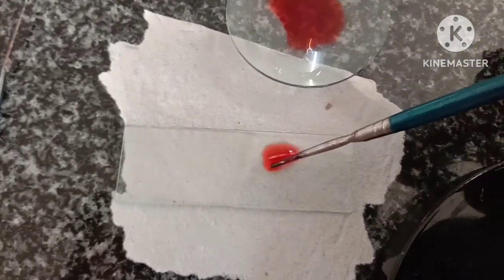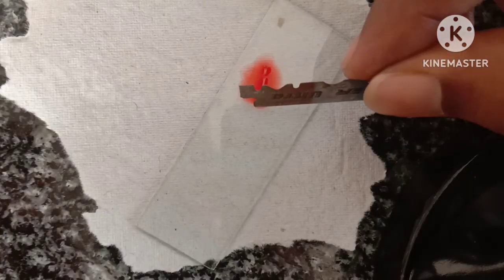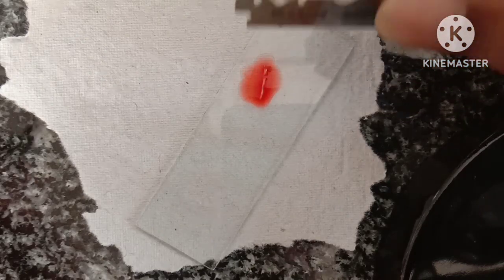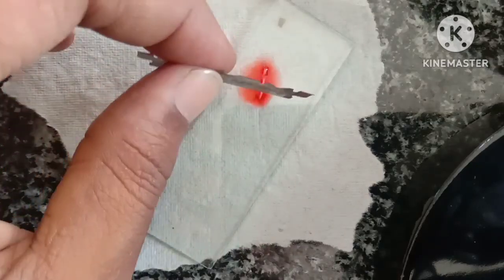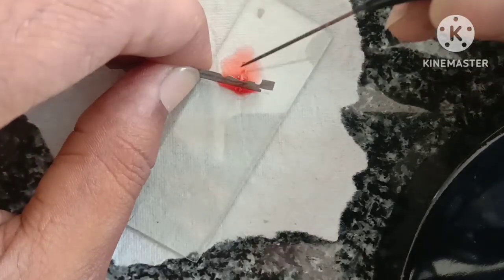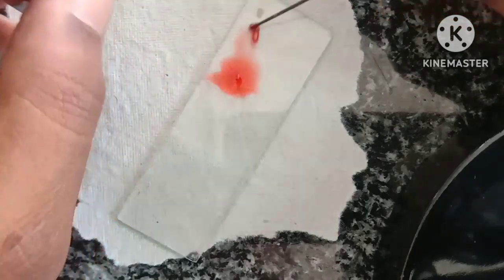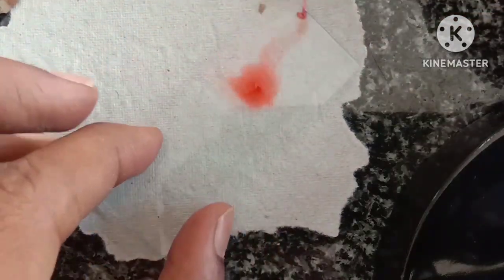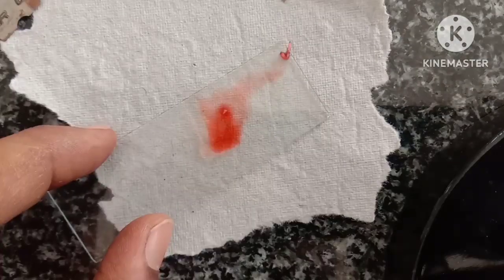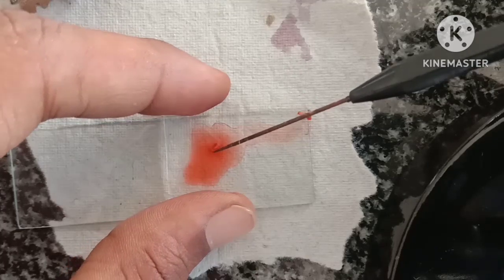Now you have to choose a root tip part where the cells are actively dividing. Take only the root tip part, like this. This is the root tip part.